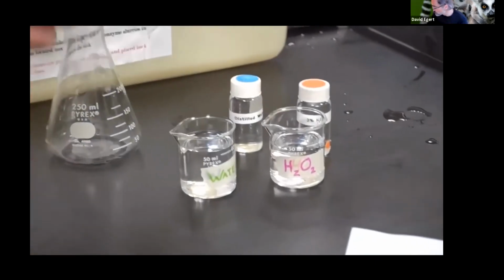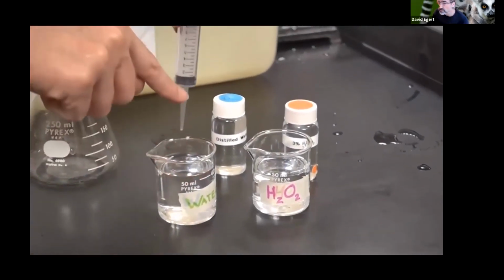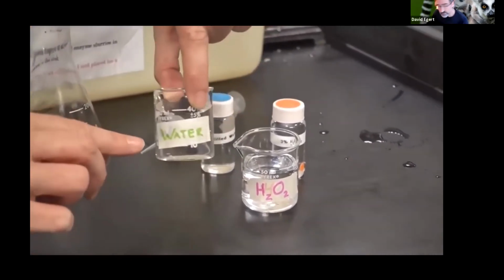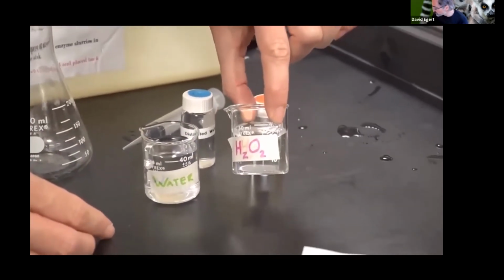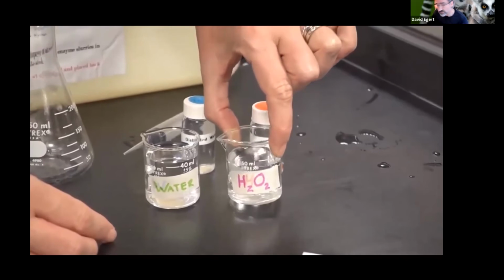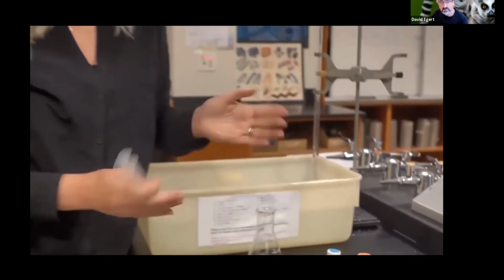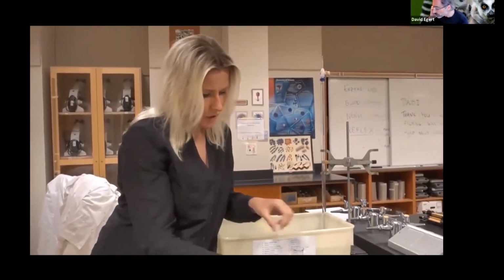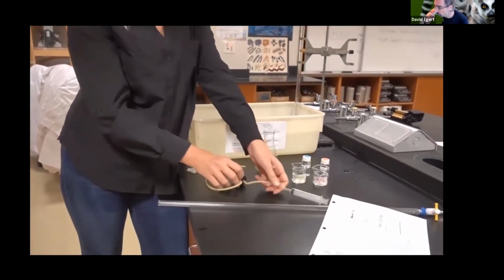You can use the syringe directly into this. However, when it starts getting low, it's hard to get in. If you do pour it over into a beaker, then of course, label your beaker, so it's easy for everyone in your group to see which fluid is what. Then after you make your dilution, you're going to stick the syringe on the shorter tube.